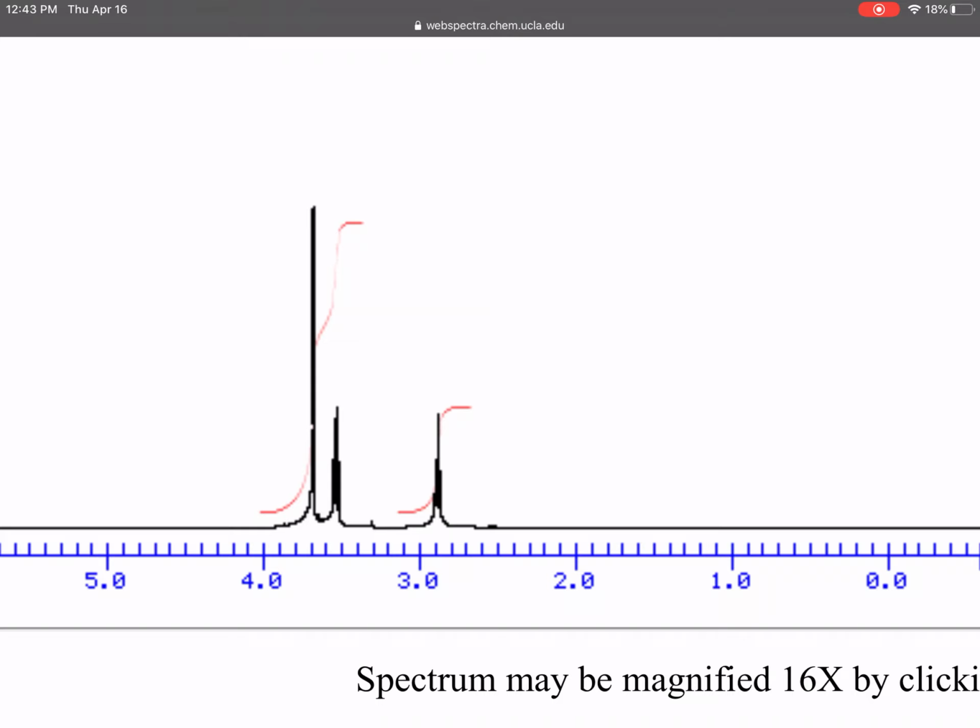And this one, you see 2 of these have actually kind of bled together, right? So you see that from about chemical shift 3.9 to 3.5 or 6 or so, you see what looks to be a singular S curve, but it has sort of a bump in the middle of it. That's actually 2 individual signals that are very, very close to each other, right? And they're just sort of overlapping. So what you have to do is try to accurately estimate where one ends and one begins.